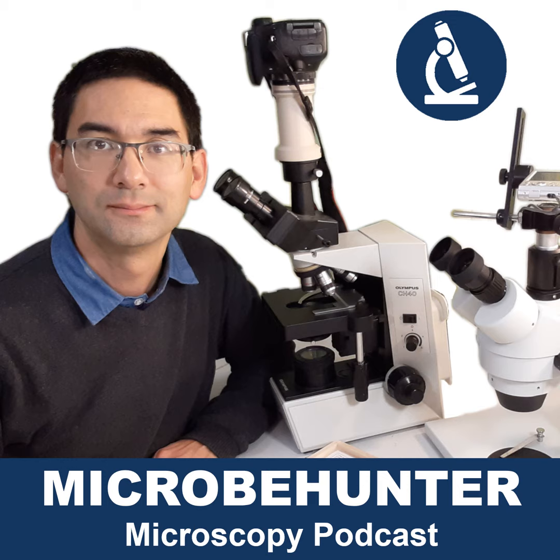Is the microscope sufficiently stable? For example, I like large and heavy microscopes, okay, because this gives me more stability, but of course at the same time you cannot carry them around as easily, which might also be important sometimes. Maybe light intensity could be another factor, especially if you want to take pictures. Is it monocular or binocular? Basically, do you look through it with one eye, or with two eyes? So there are other factors that I would actually worry about, and not so much magnification.